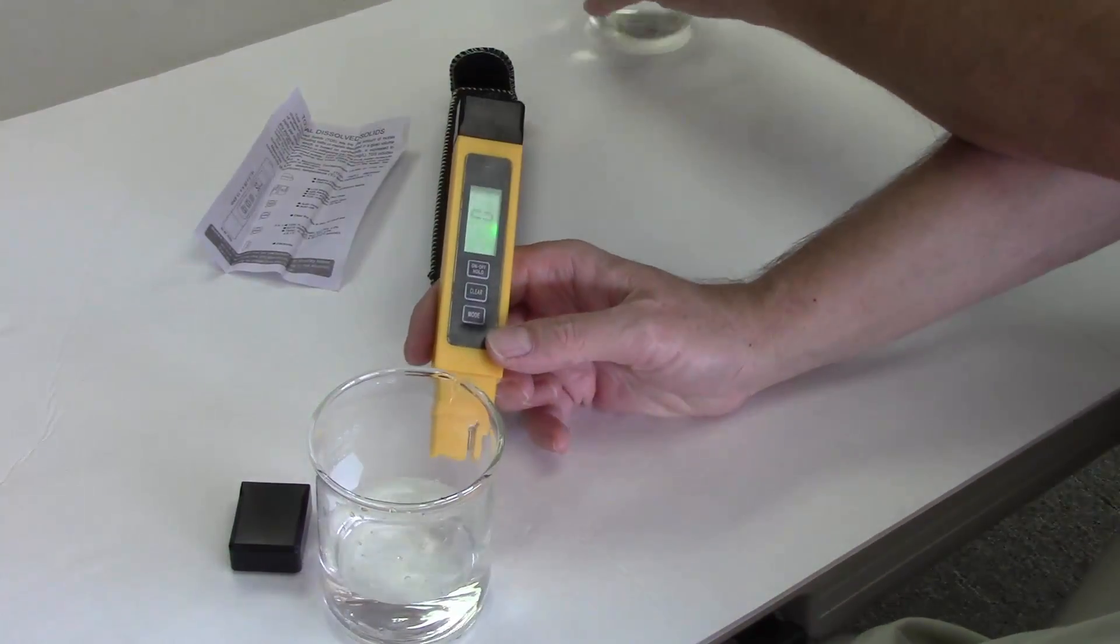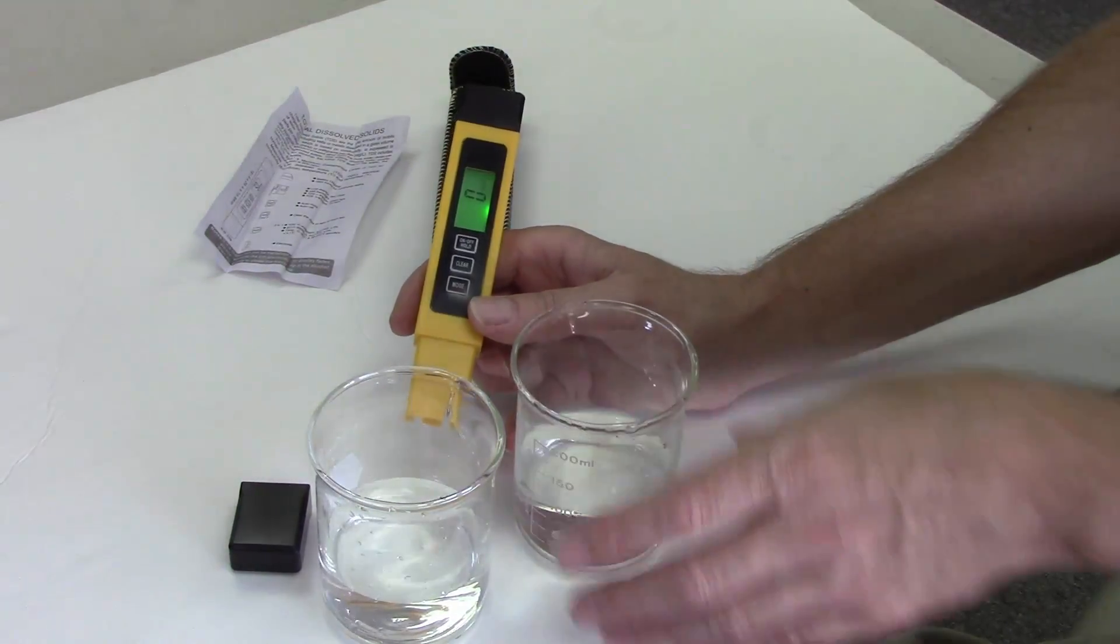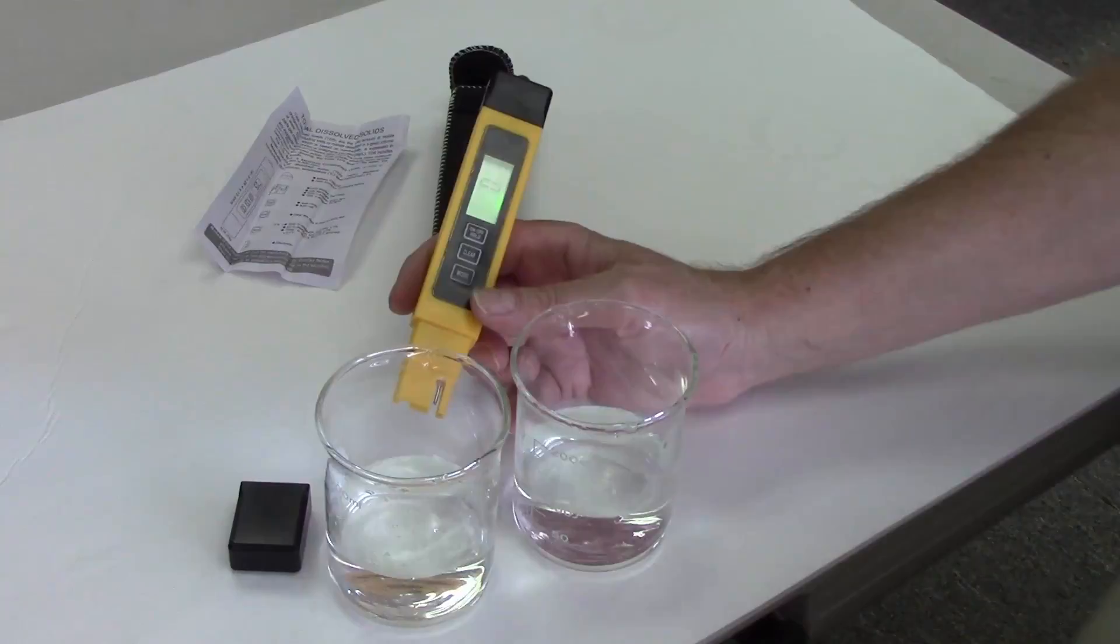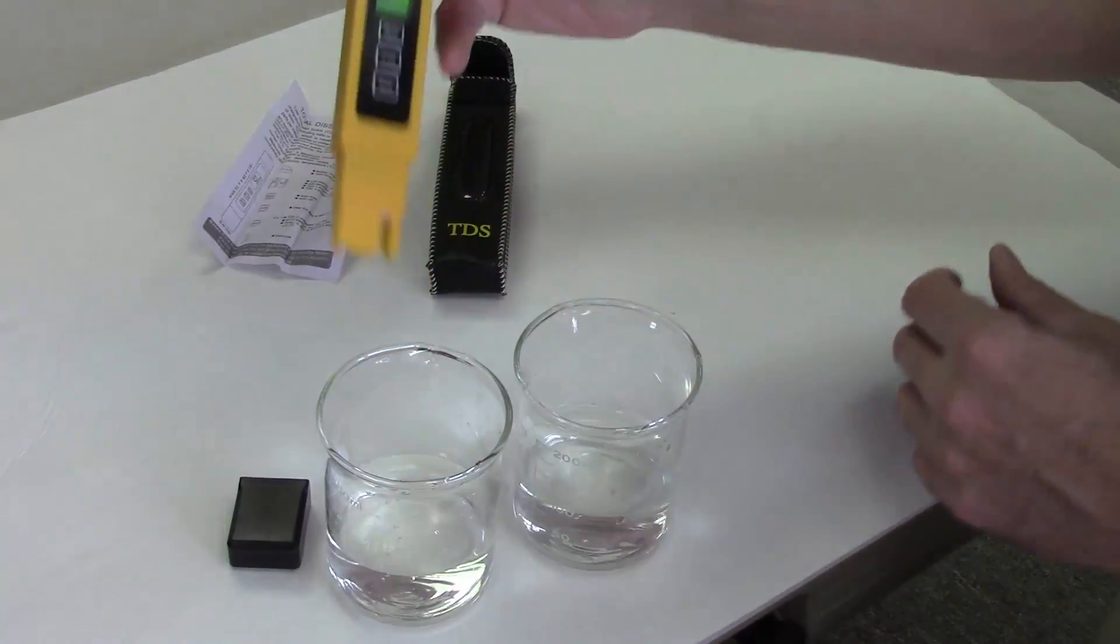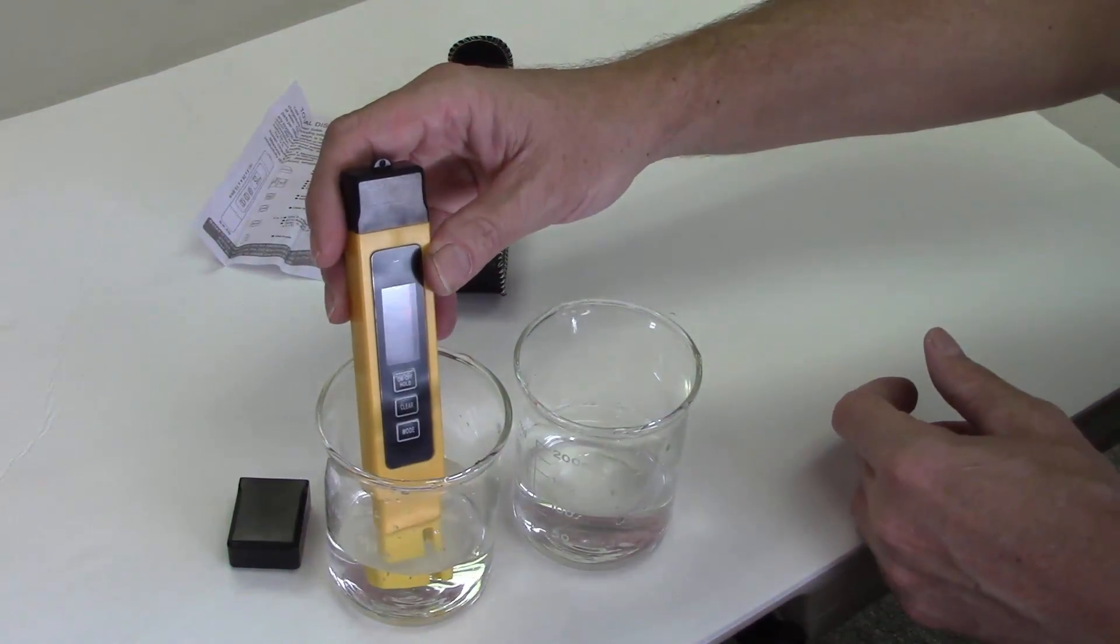Now I have two samples of water here. One is city water and one is reverse osmosis water. So one of them is going to ding out real hard and have a lot of TDS in it, and the other one is not.